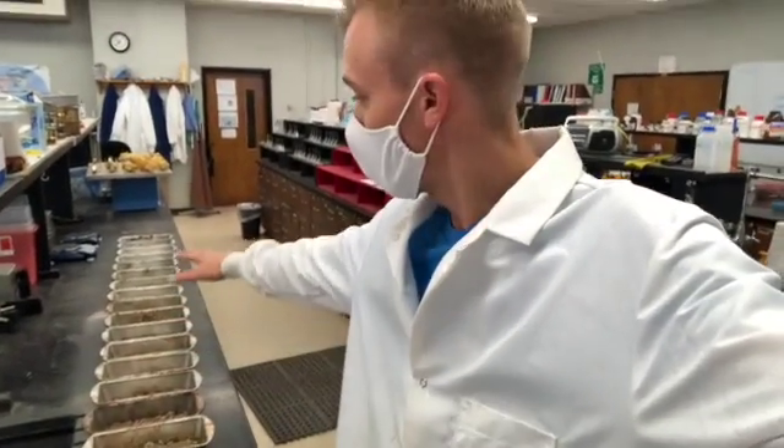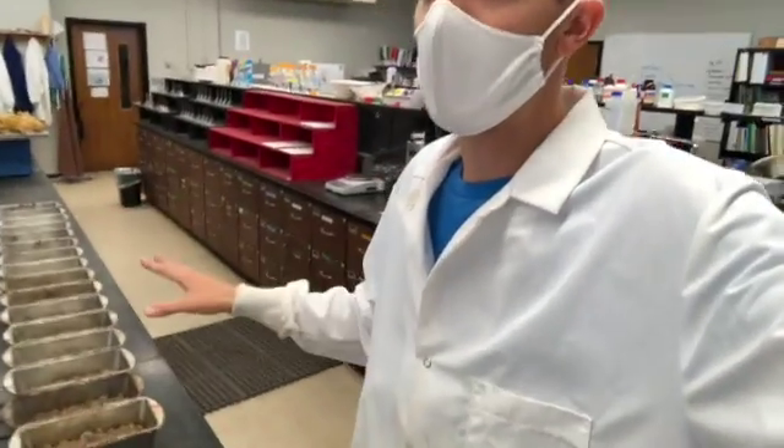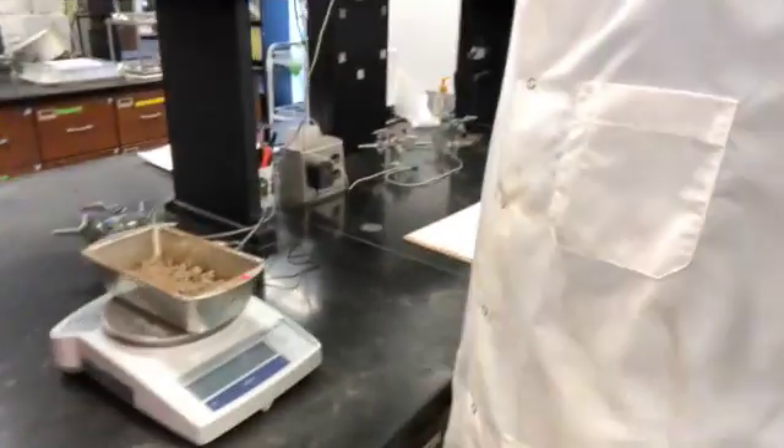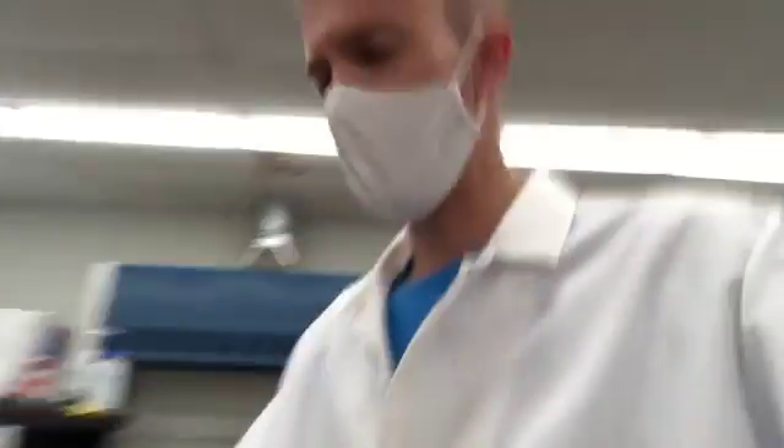The bulk density samples have been in the oven at 105 degrees Celsius for 48 hours. After taking them out, let them cool down, then place one of these pans on the scale to get the combined mass of the pan and soil. Subtract out the pan mass — which I recorded prior to putting the samples in — to get the mass of the soil alone. That mass is then used in our bulk density calculation: mass of the soil divided by the volume equals bulk density.